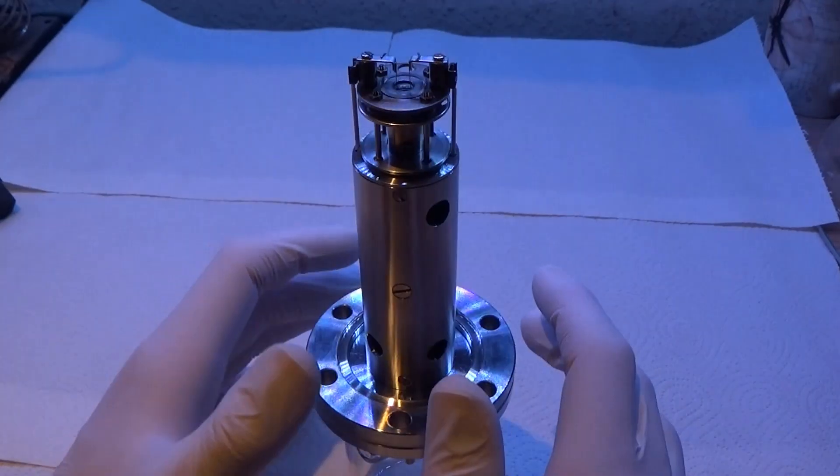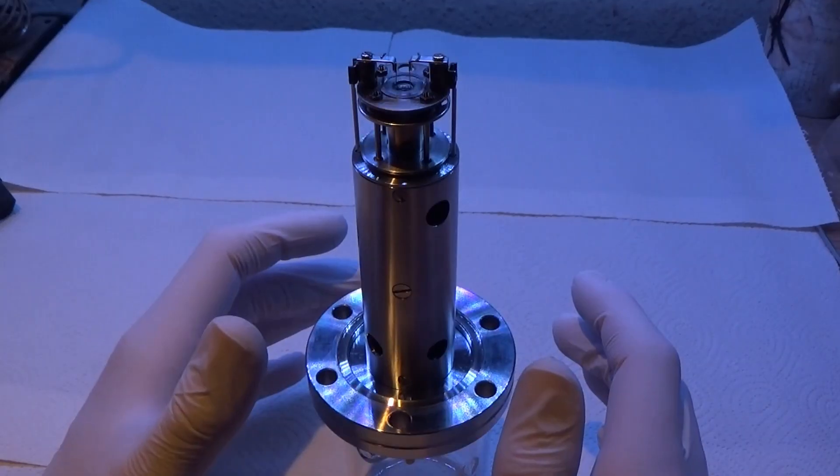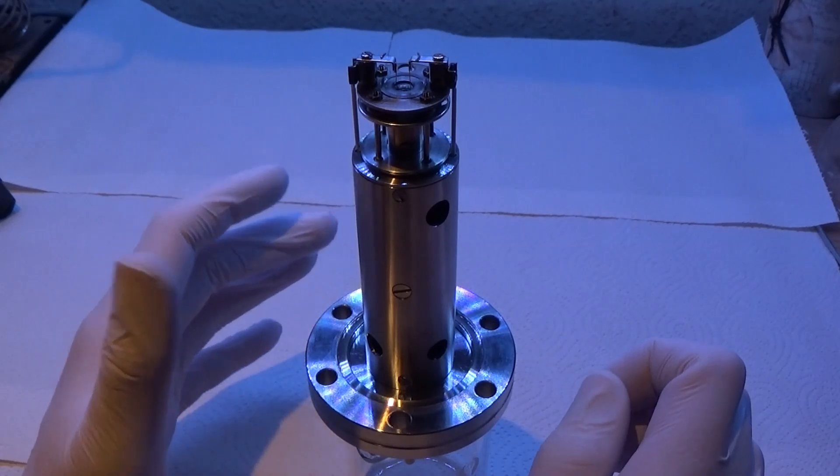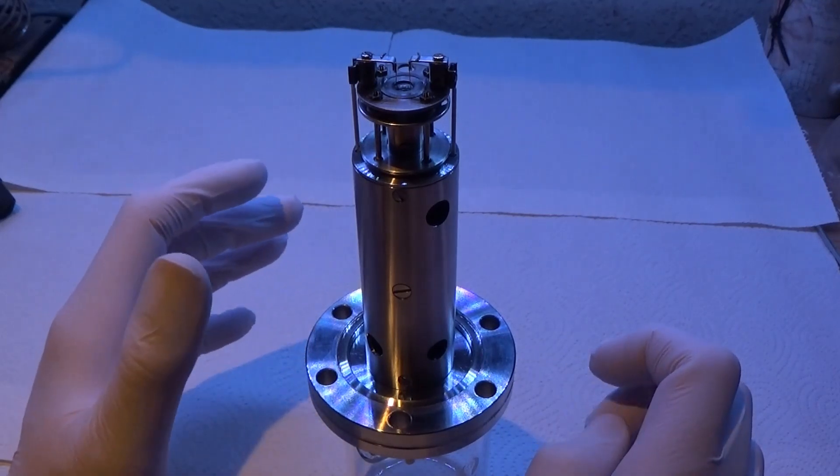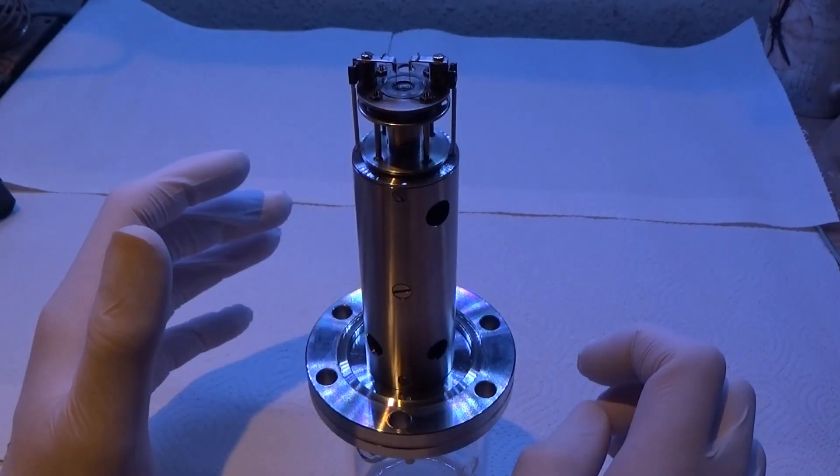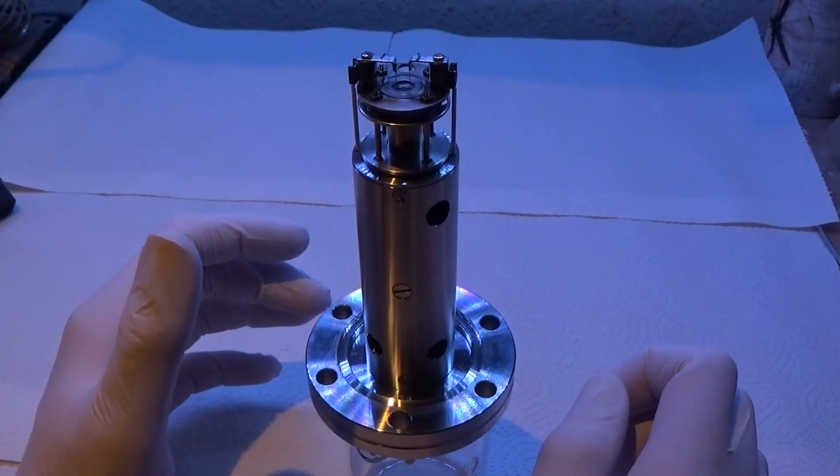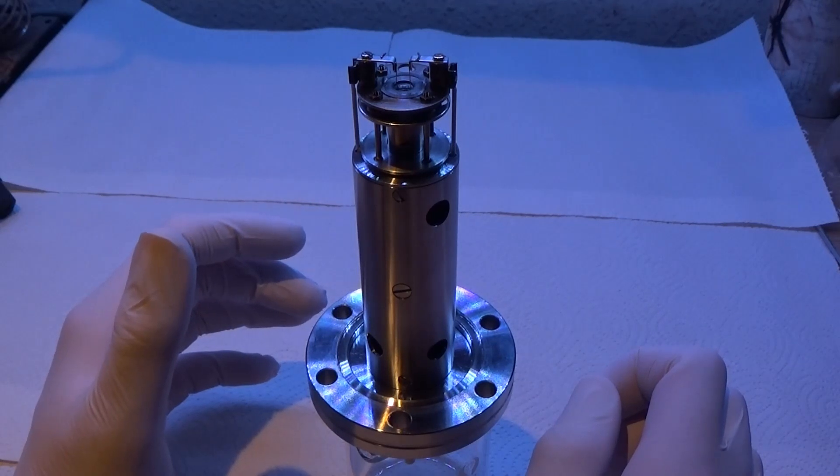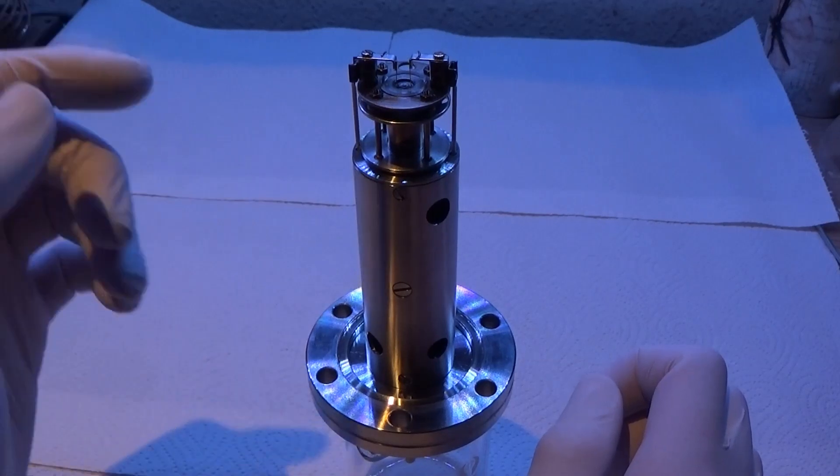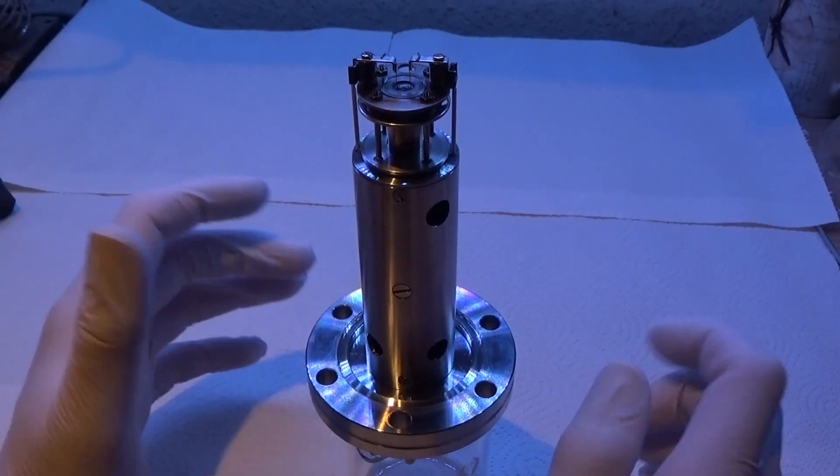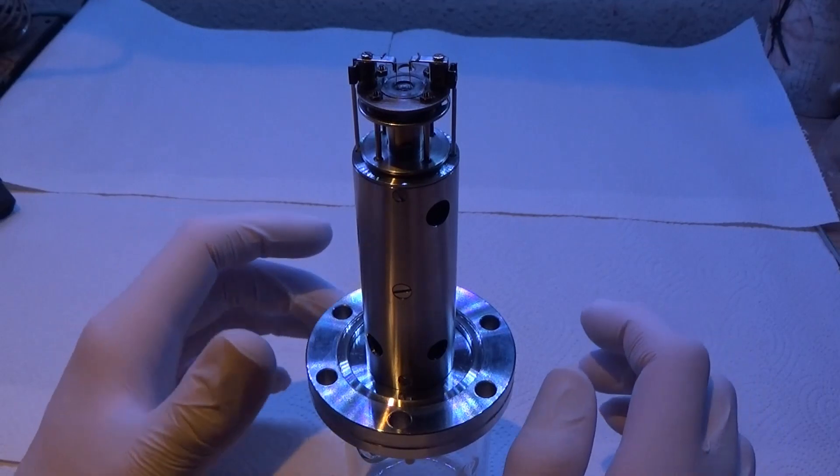They serve the function as a leak detector. This is a really neat trick where you tune your mass spectrometer to only detect helium, and then you go around with a bottle of compressed helium, and then you squirt that around the exterior envelope of your vacuum system with a little hose. And if there is a leak, then the helium will enter and the mass spectrometer will immediately give a reading, but only for helium. So it's pretty stable actually.